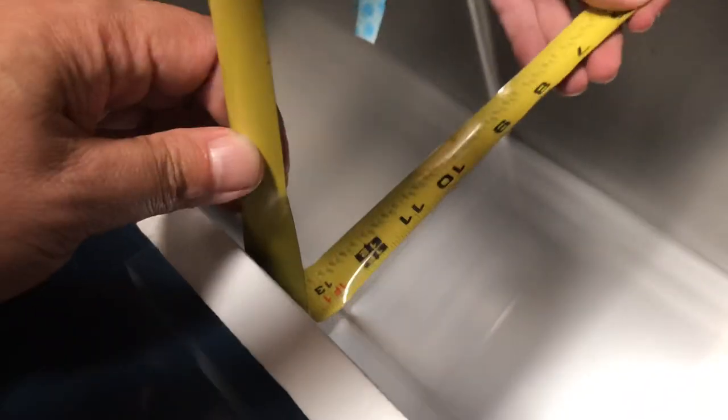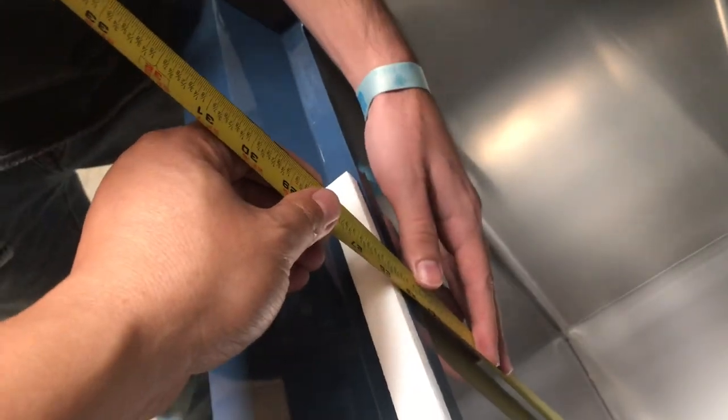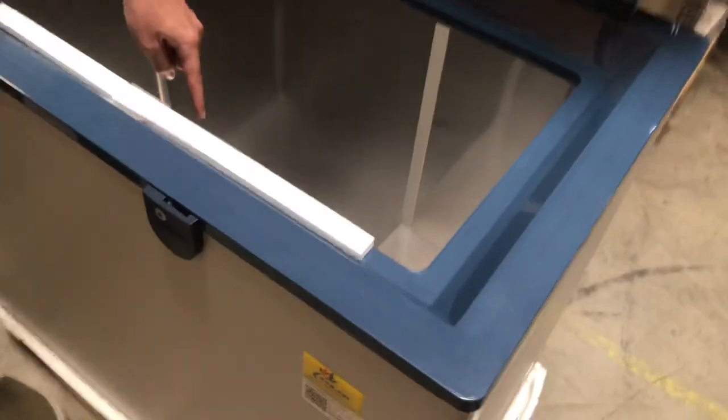So overall, let's give you the inside dimensions. For the length, you're looking at about 30 inches inside. And then for the depth, all the way down, you're looking at about 26 inches. The unit also has a drain — it's inside and goes out through the front of the unit.